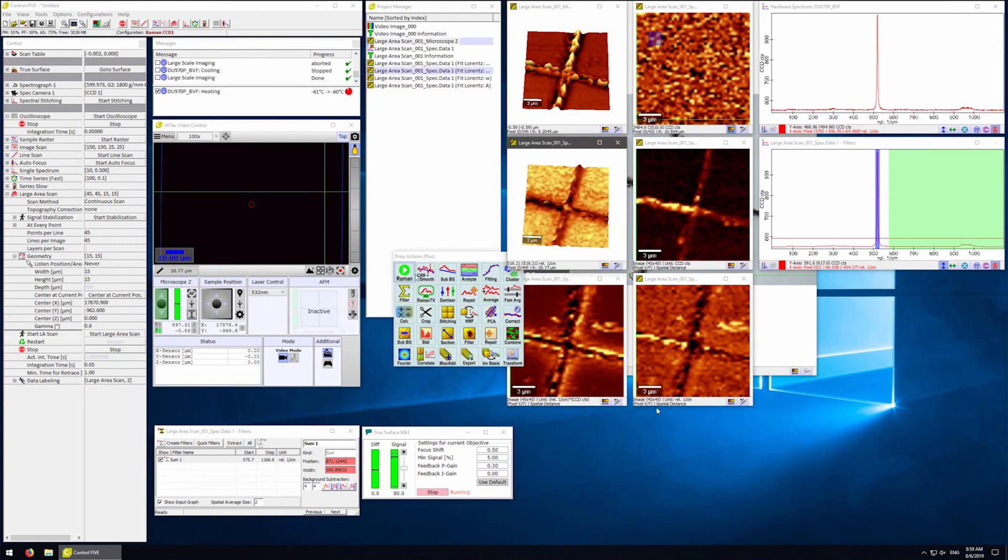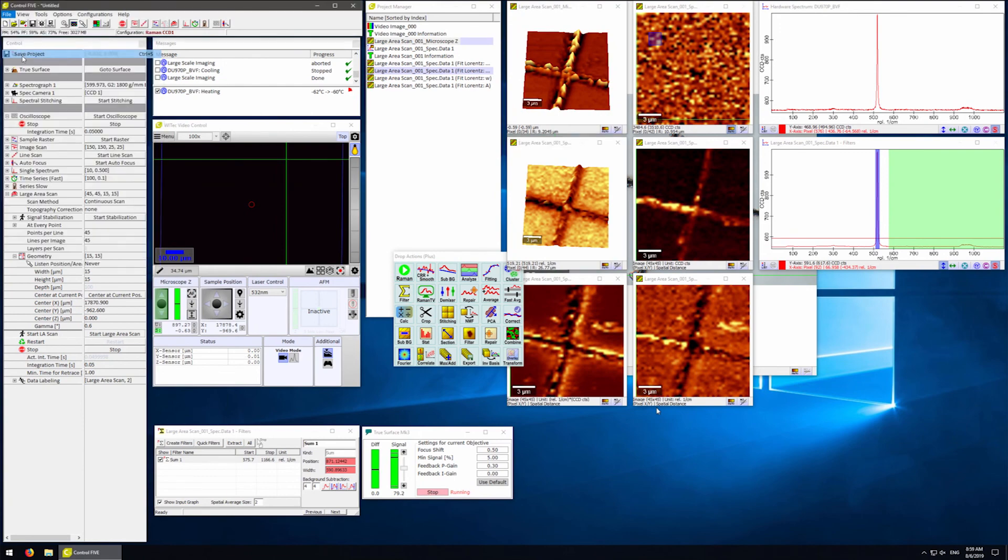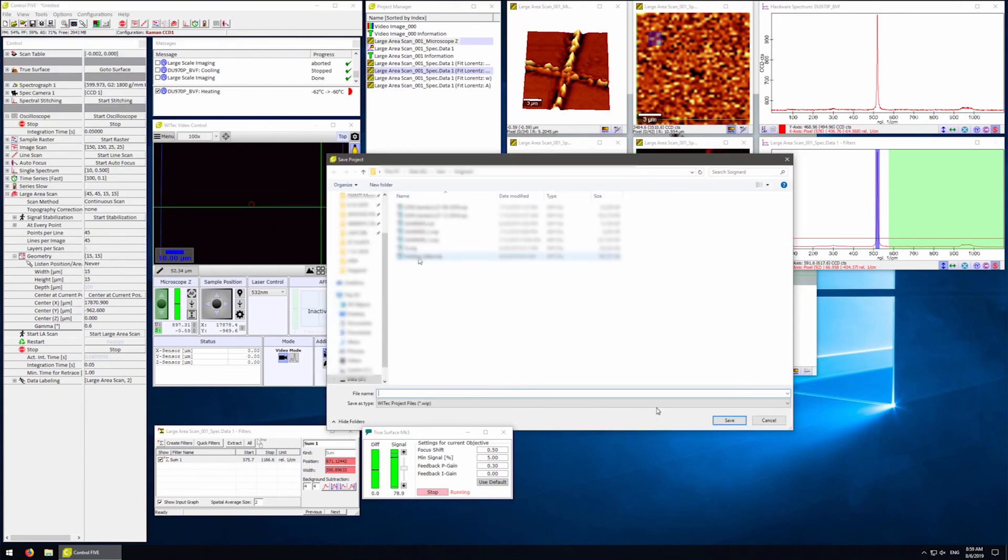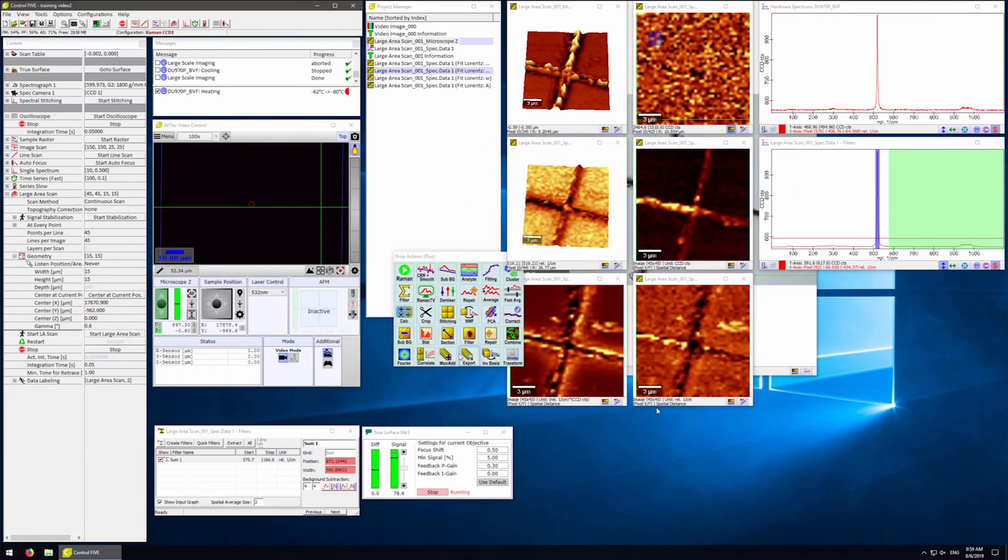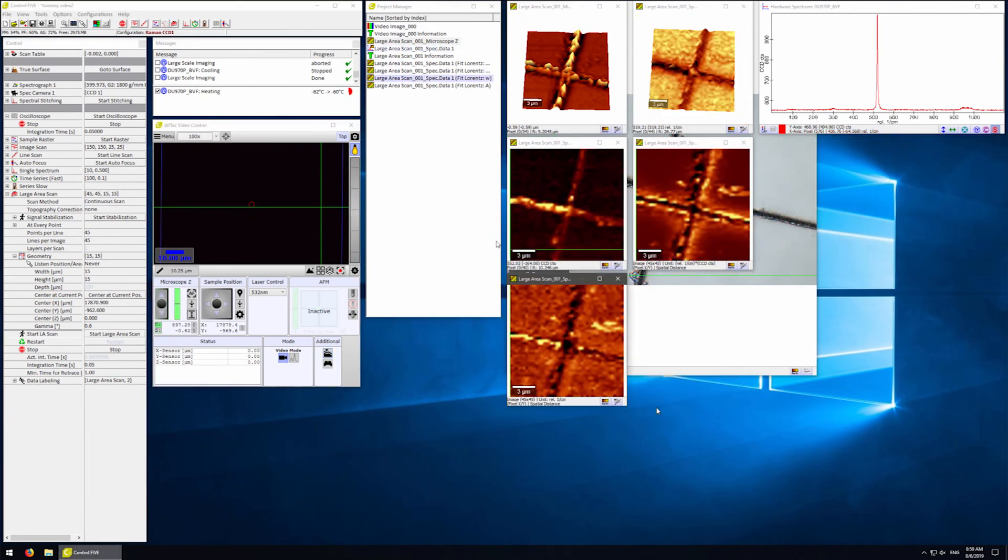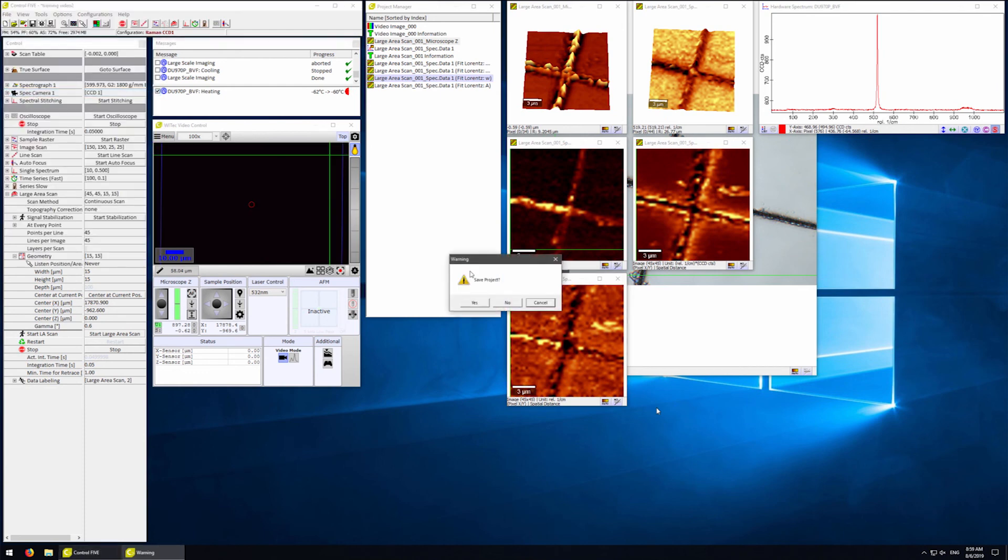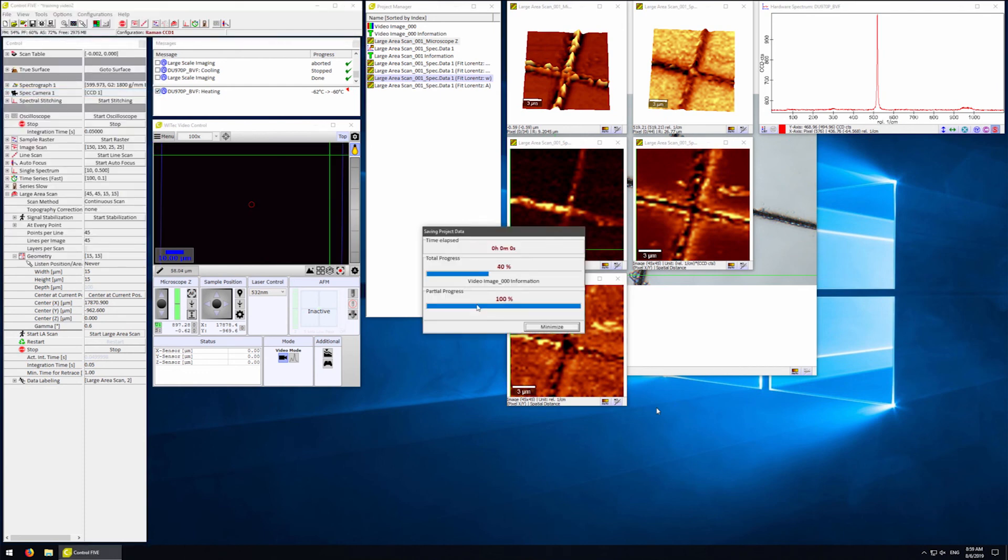To save the project, go to File, Save Project, then type in the project name of your choice. When you're done, go to File, Exit, and save changes to your project if needed.